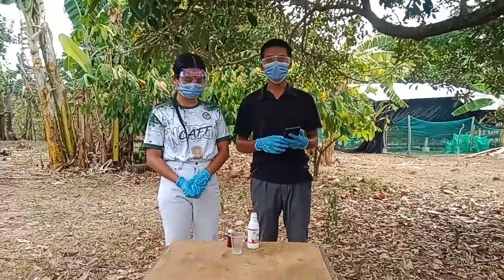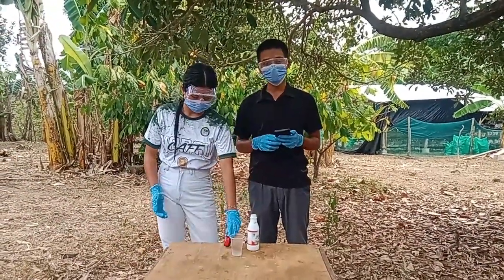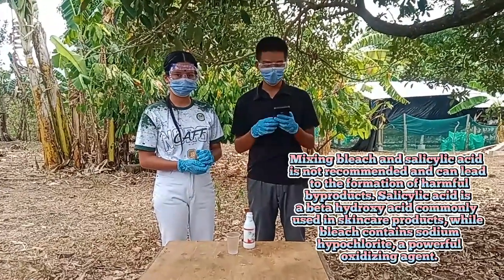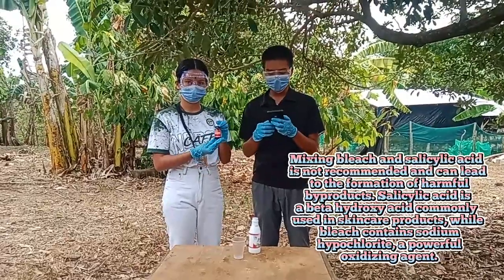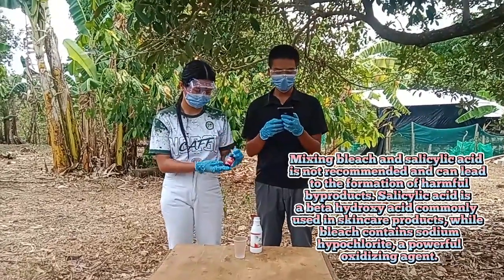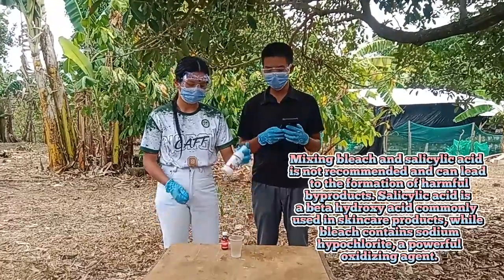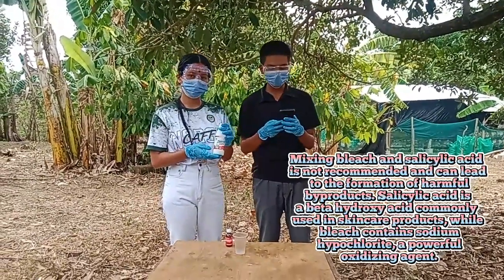So our next experiment is all about mixing bleach and salicylic acid. Mixing bleach and salicylic acid is not recommended and can lead to the formation of harmful byproducts. Salicylic acid is a beta-hydroxy acid commonly used in skincare products, while bleach contains sodium hypochlorite, a powerful oxidizing agent.